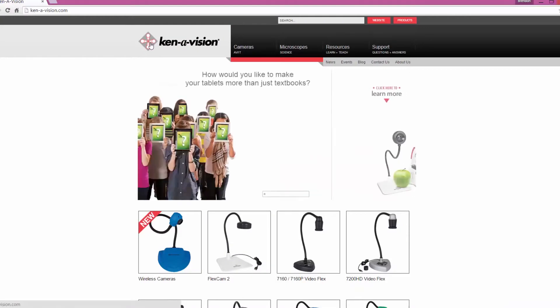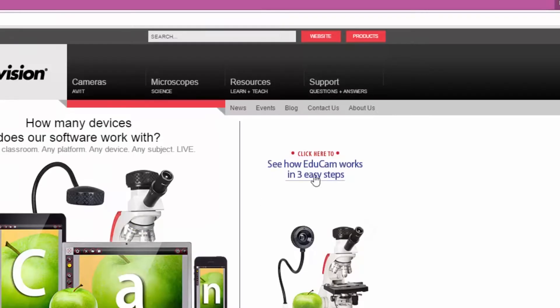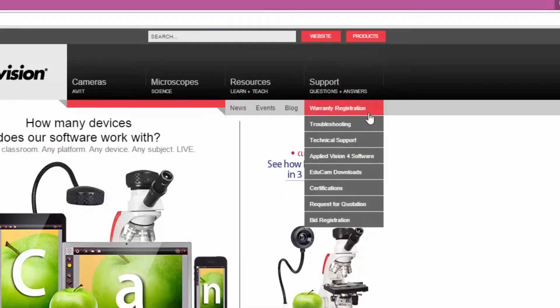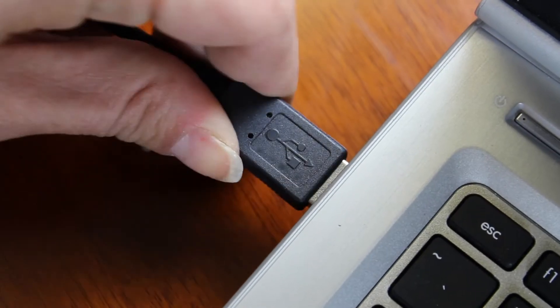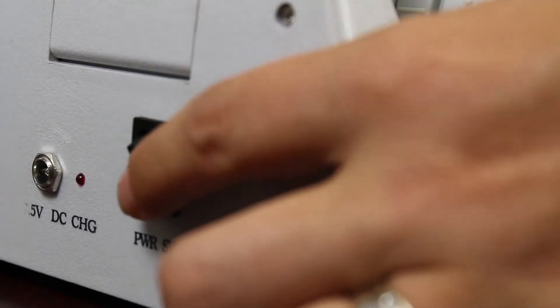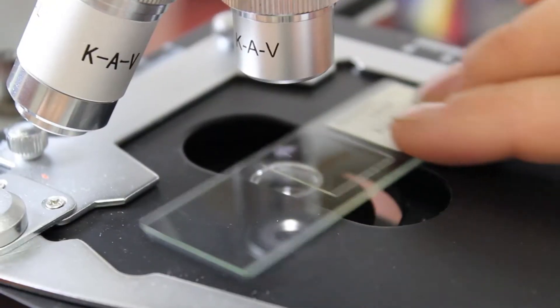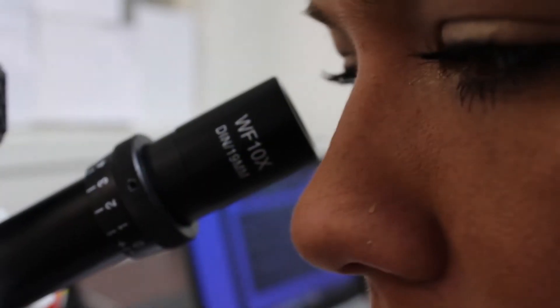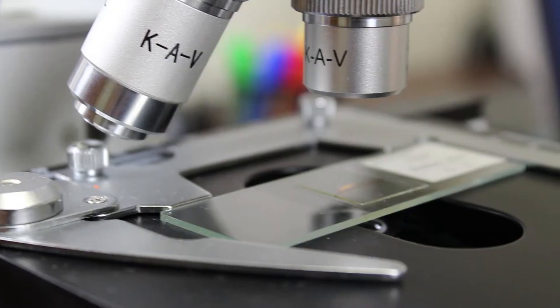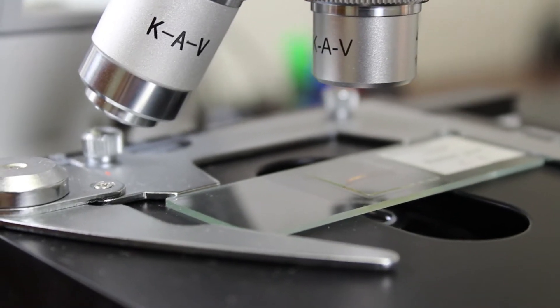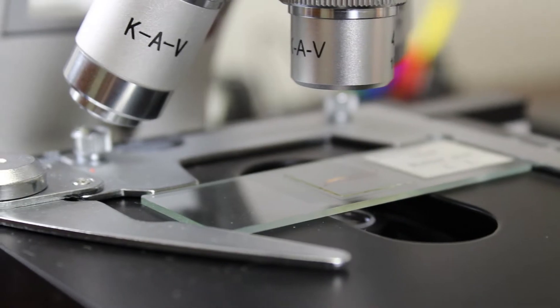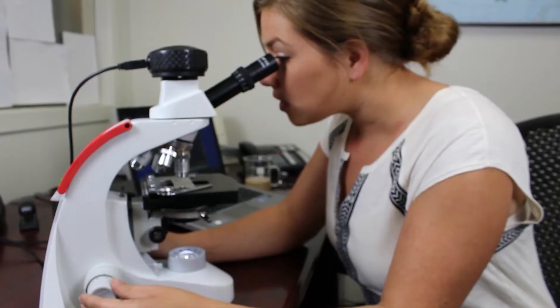First, navigate to the KineVision website and download the software. Plug in the USB and now with your microscope set up, we're going to look at a stem under 40 times magnification.